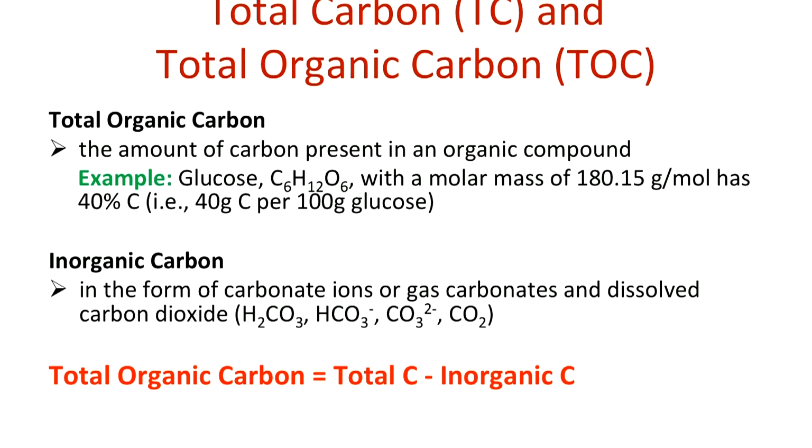Today, we will introduce briefly the different instruments that we will use for water quality measurements. And then after this, we will go to our instrumentation lab to show you these different instruments. So the first instrument that we will discuss is the total carbon analyzer.